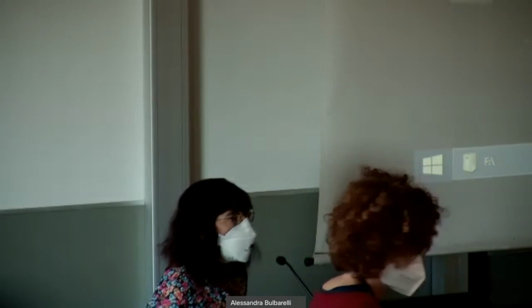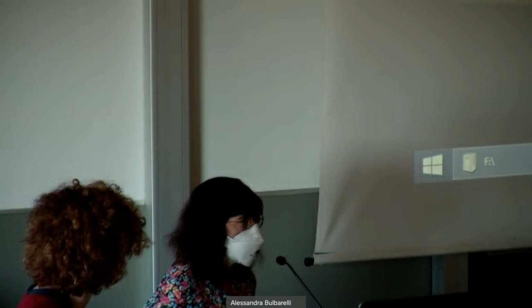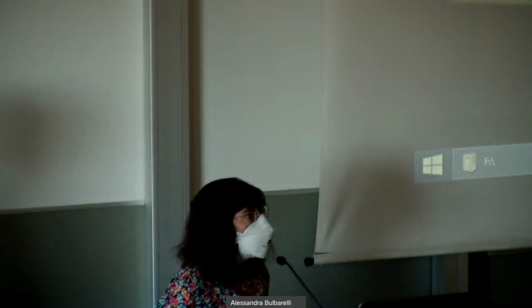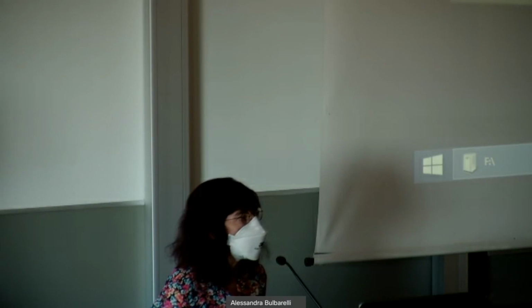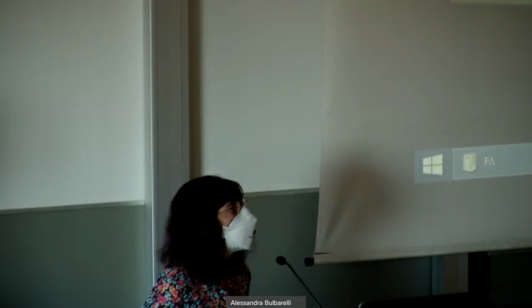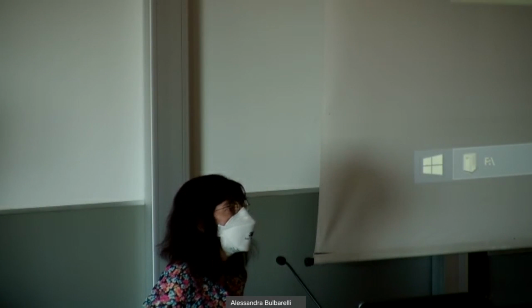Yeah, we tried a little bit, but for that, I think we don't have enough images yet. But we also tried to use random forest, to try to characterize which were the parameters that could best separate the data. So we are working on that. But for that, I think the number of images that we have is still small. So we need some more measurements to be able to do that.